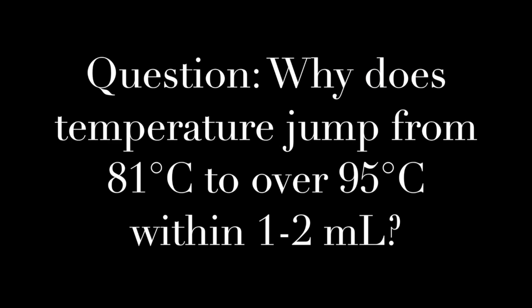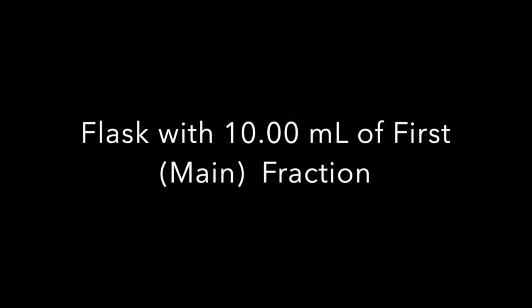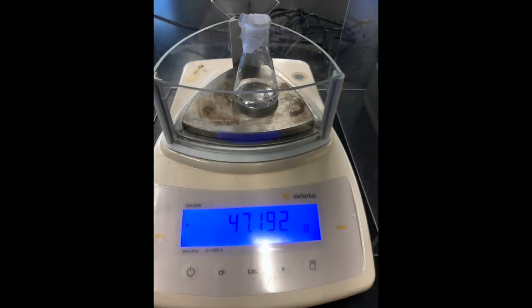You can see the appearance of the liquid is now quite different. We took our main fraction, which collected at nearly the same temperature, and measured its density. First, we weigh the empty flask with the parafilm. Then we pipette out exactly 10.00 milliliters using a volumetric pipette, place it into the flask, cover it, and take its mass. From the density we can then calculate the mass percent and volume percent of alcohol in our main ethanol fraction.